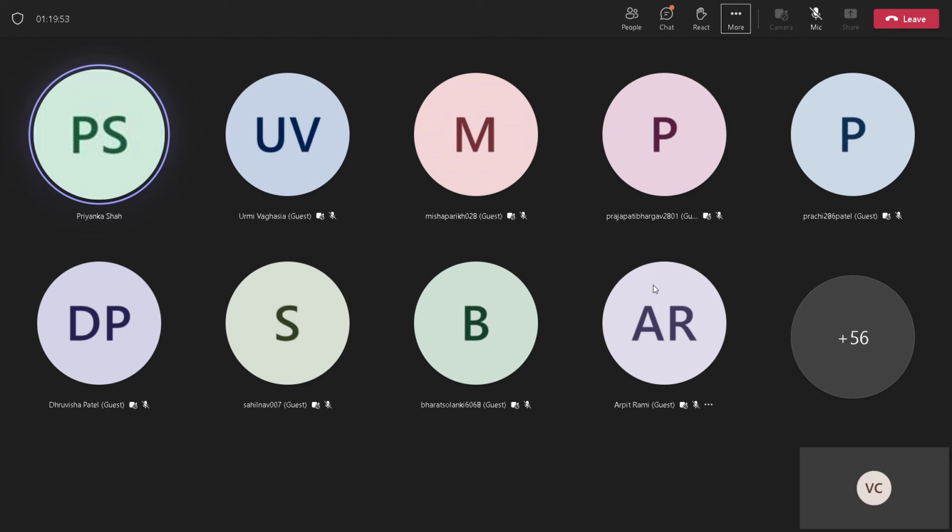In this way, by varying polarity and non-polarity, you may ask questions. Then one question could be: why is a black spot observed on the TLC plate in UV light? Because in TLC you are adding a fluorescent compound, that's why.